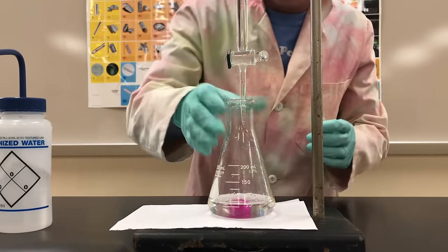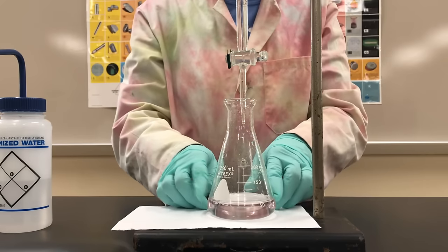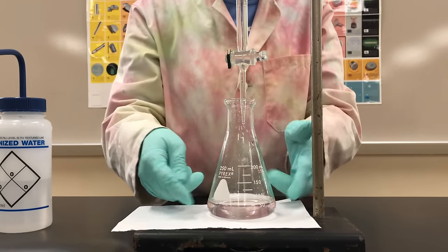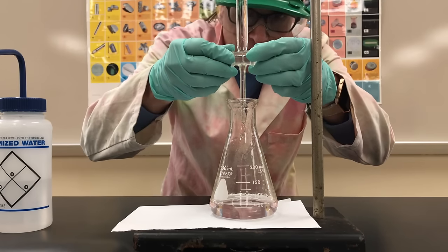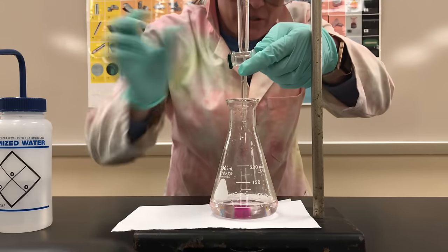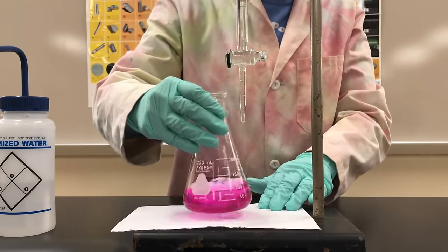This is where the amount of base and acid are equal in my titration. So my moles of acid equal my moles of base. Due to the indicator showing a pink color at this point, it's telling me I'm reaching what's called the end point via the indicator, but the equivalence point based off of moles. So I believe I'm one drop away. So let me see if I can do this. There it goes. And it looks like there is one more on the tip. This should be the end point. There's that bright pink color that's persisting.